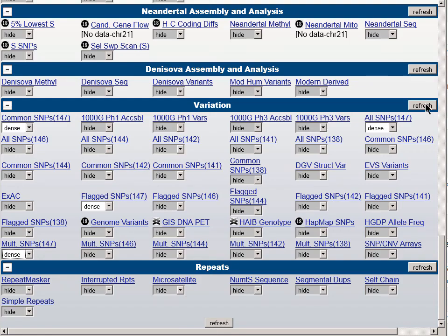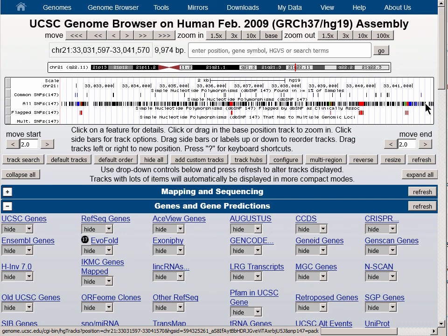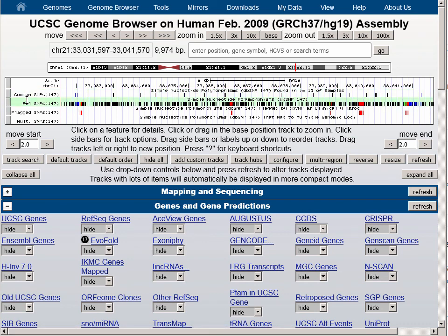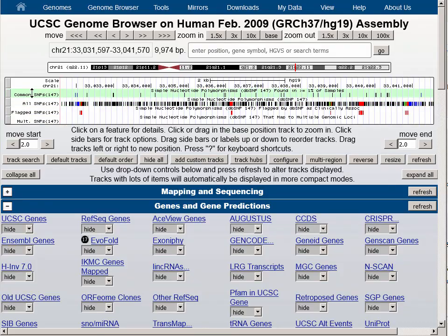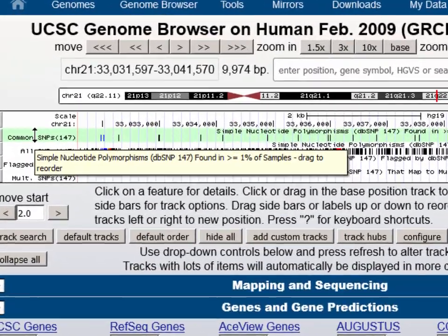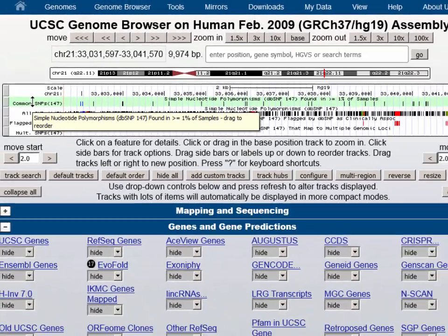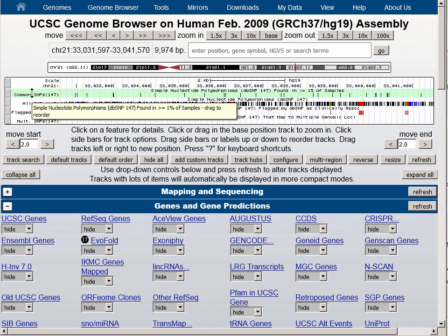Let's refresh and load these tracks into the browser. We can see that the number of SNPs in these tracks varies widely. All SNPs has a very high density because it has all of the SNPs from the DBSNP database, regardless of how common they are — it is a proper superset of the other three tracks. The common SNPs are found in 1% or more of the population, and they must be present in the database at least 10 times to avoid treating rare variants as common. Some SNPs in DBSNP are reported as 50% minor allele frequency, but they are cases where the variant has been reported from only one person ever as a heterozygote, so NCBI dutifully reports 50.000%, but it is not a common variant.